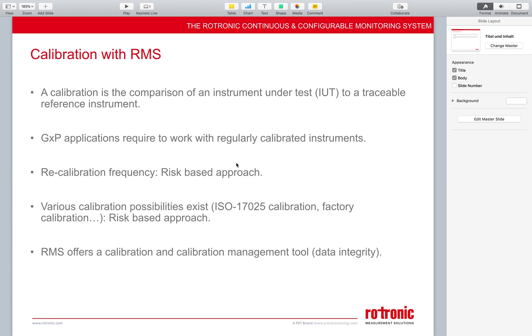Frequently get asked about calibrations within the Rotronic monitoring system, so we've made this short video.